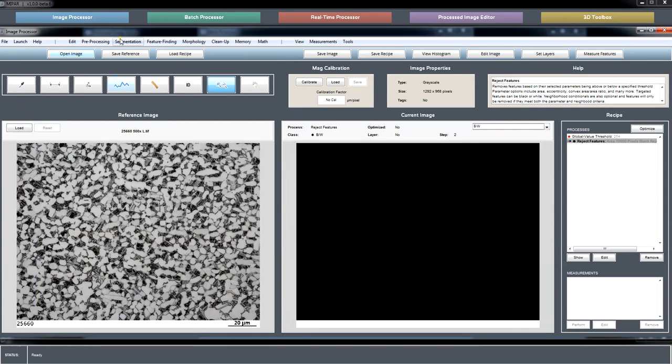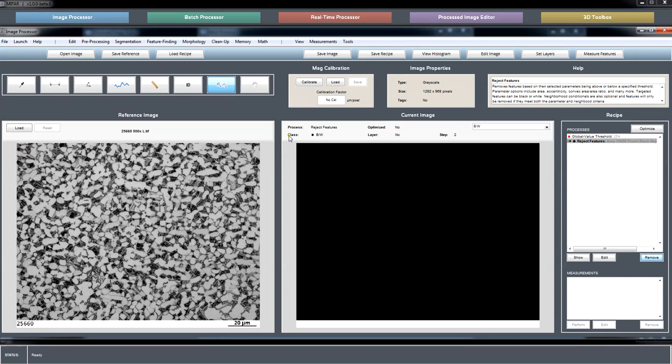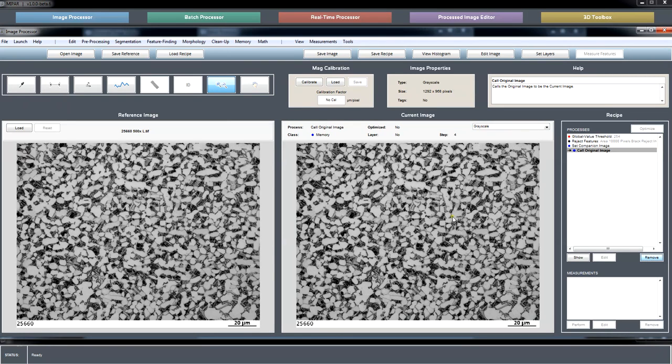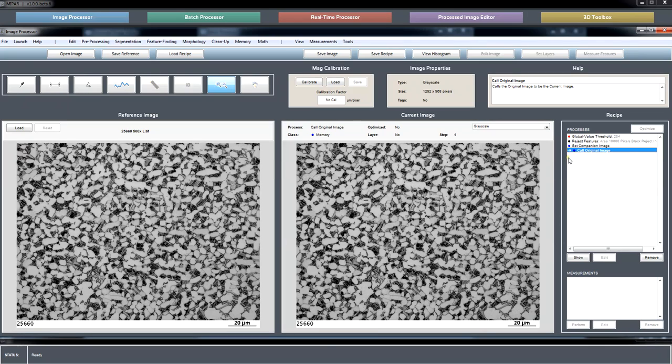Get rid of that text, flip around this segmentation, or actually leave it like that. Now whatever segment, I can put this away in memory and bring back the original. Whatever segmentation I come up with, if I just do a keep lighter between that segmentation and the companion, it's going to erase basically any of my segmentation that sits in the micron bar. So that can be a nice way of setting up a process window, as you called it.